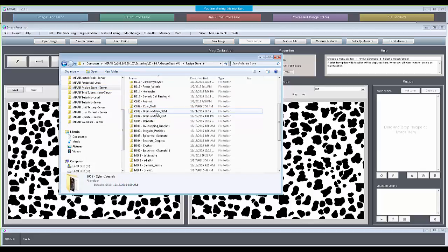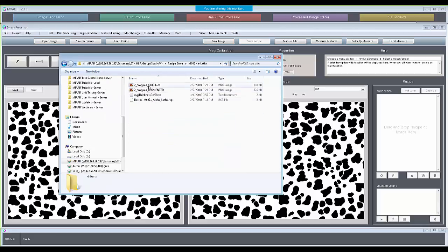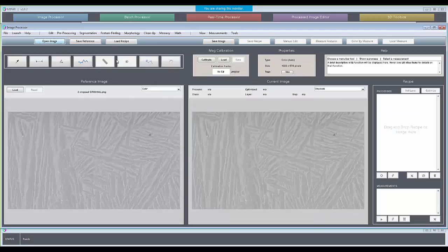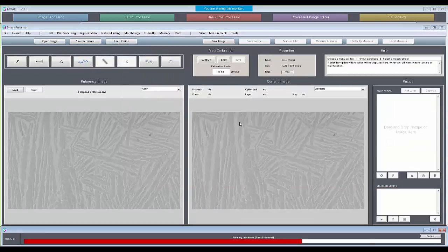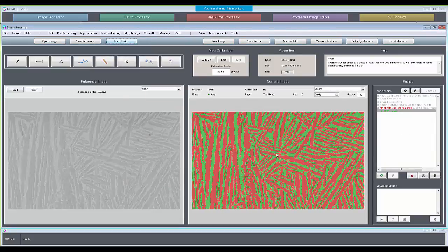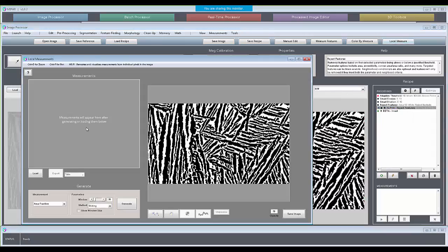Let's go down here to one of my plate-like feature images where we can show local thickness, and let's load in this recipe. So we have the plates and the background, and if I take my plate features and do a local measurement of them, then we can switch to thickness, which will now give us a skeletonization method and a trim threshold.